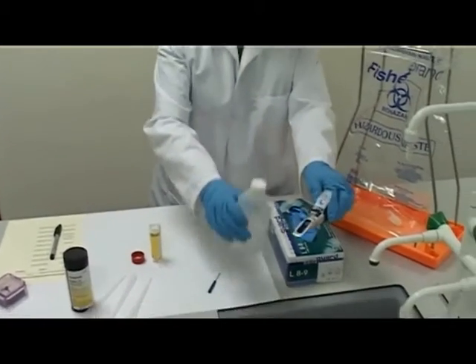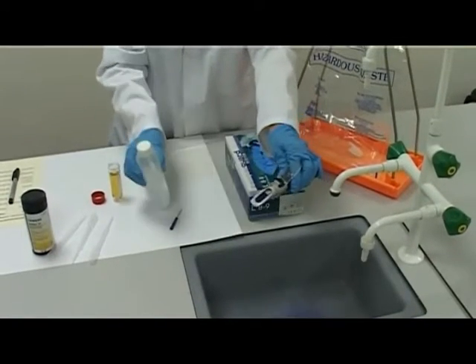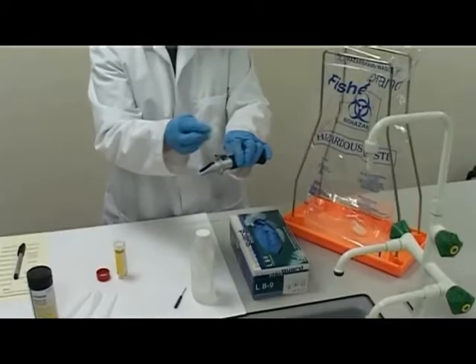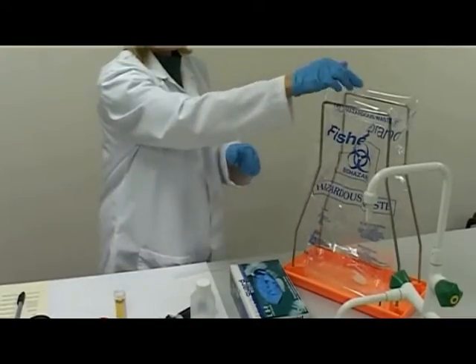Rinse the prism with water and dry using a dry tissue. Dispose of used materials into the clinical waste bin.